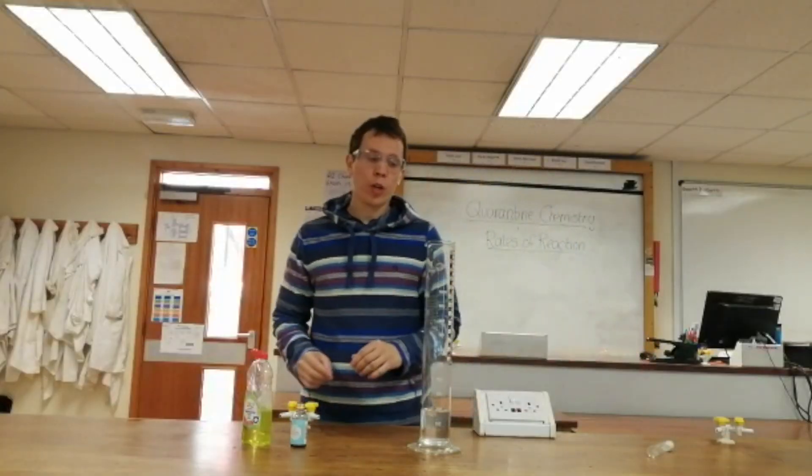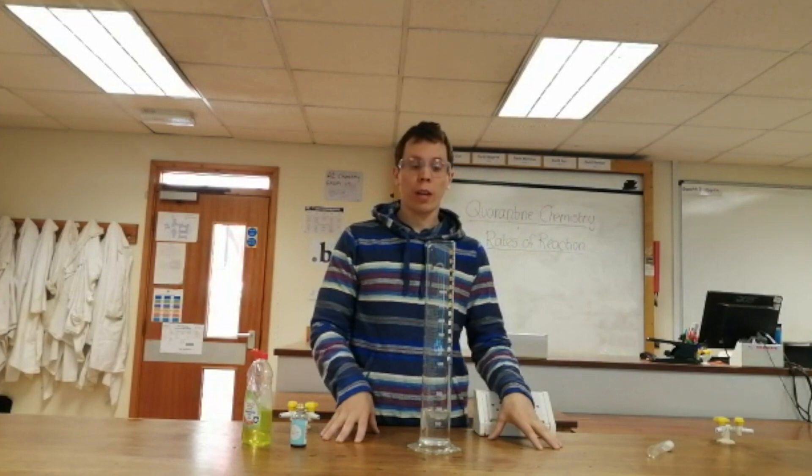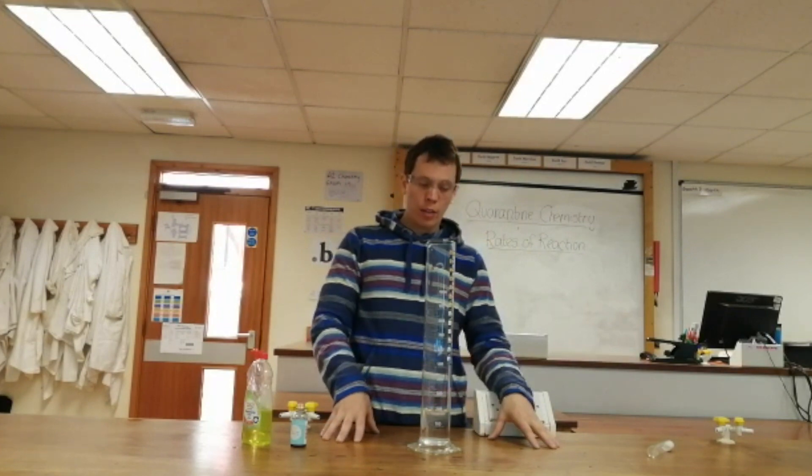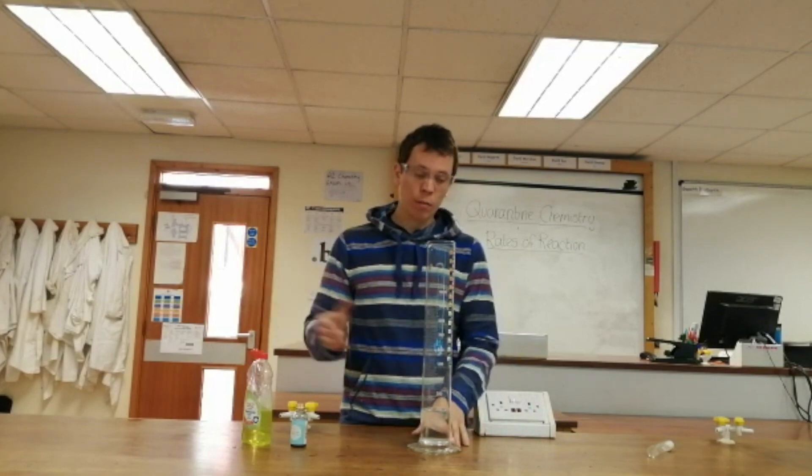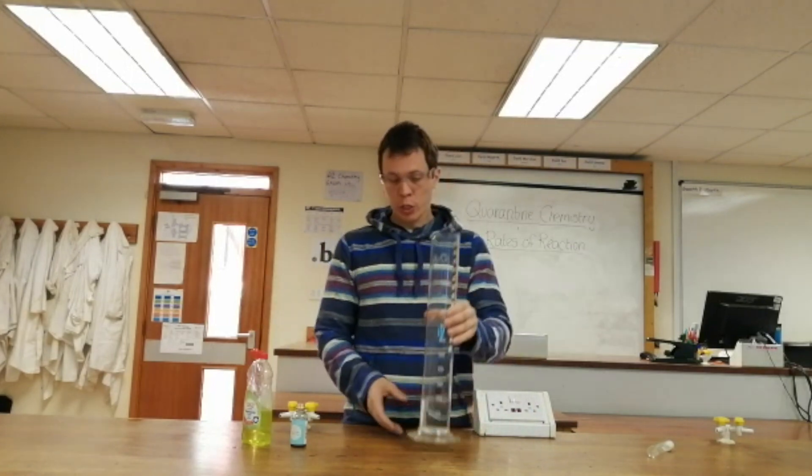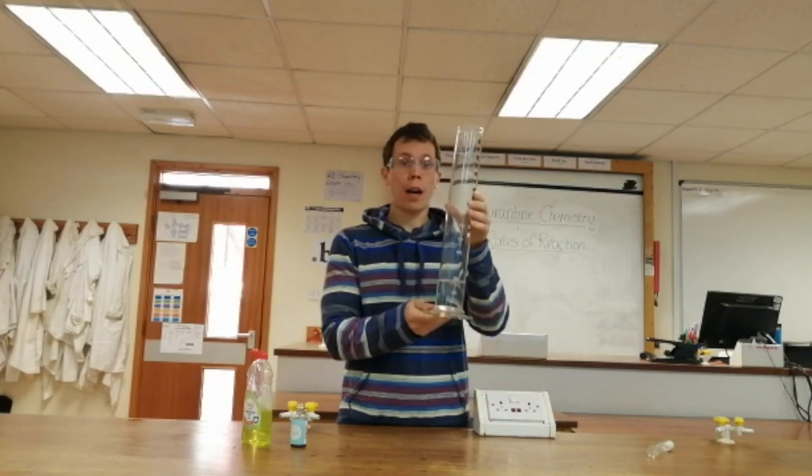In this experiment, we're going to be looking at how a catalyst can change the rate of a reaction. The reaction we're going to be looking at is the decomposition, the breaking down of hydrogen peroxide. In here, I've got 200 millilitres of hydrogen peroxide.